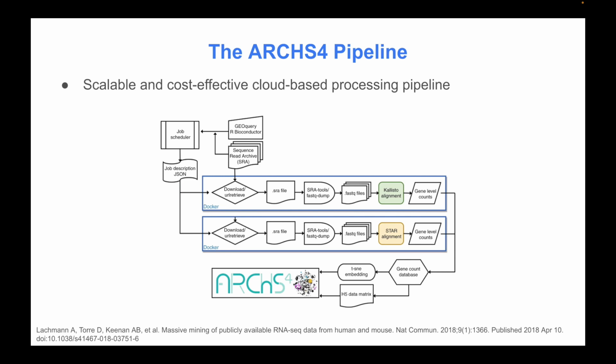All RNA-seq data in ARCHS4 is processed through the same pipeline in order to maximize the interoperability of the data and facilitate more meaningful downstream visualizations and analyses. The pipeline operates entirely in the cloud, which reduces the computational cost of such a large workload and allows users to directly access processed data rather than running a pipeline themselves.